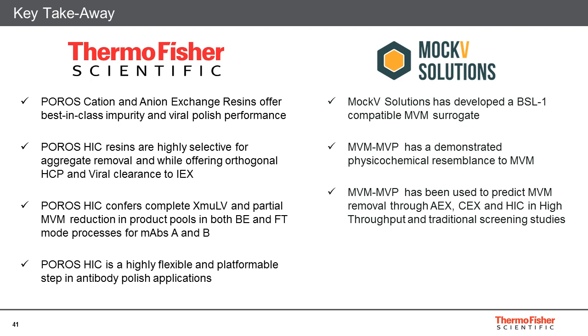And I think really that stems from the uniquely designed selectivity of these resins for these impurities. And I think HIC in general would be an excellent and flexible downstream tool in the toolbox for all kinds of biotherapeutic capture and polishing in general. And specifically for mAbs, I think it's also a platformable polish step in your downstream process.